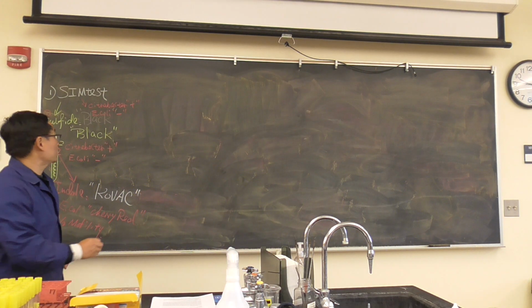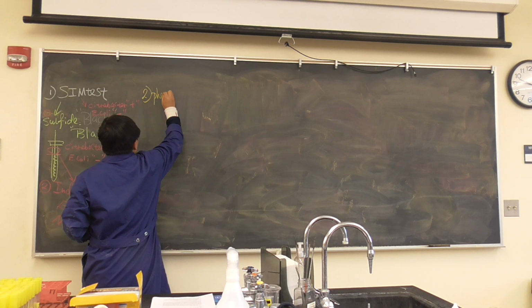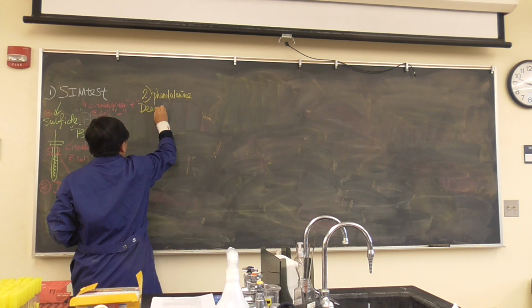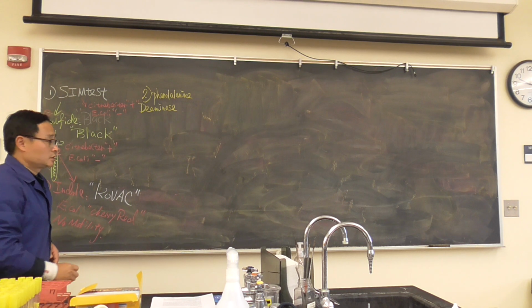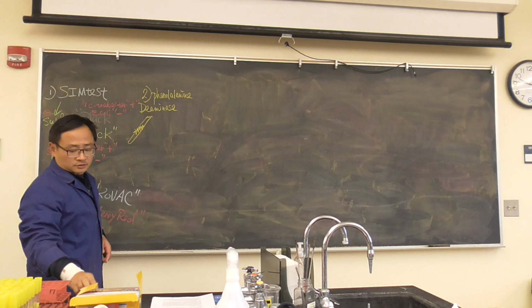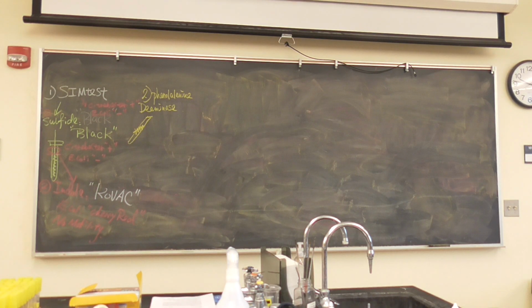Second test, what do we have? Phenylalanine deaminase test. So what should we do? You have a slant. Remember? Zigzag. Okay, let's get a slant. E. coli and Citrobacter. Let's get Citrobacter. Simple.